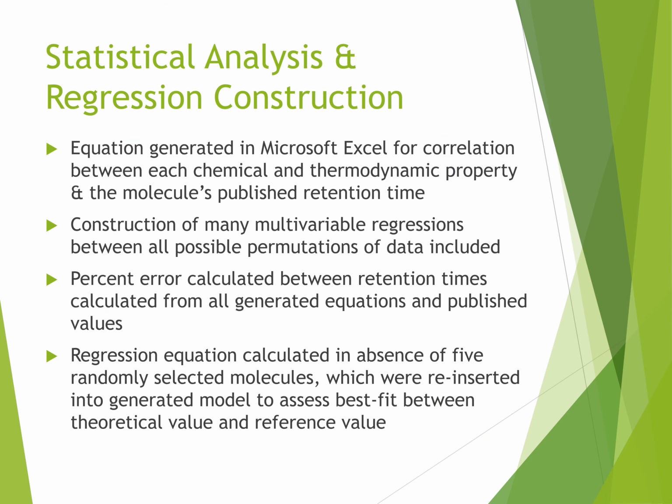After data for this research has been acquired, we will proceed onto the statistical analysis and regression construction. Equations have been generated in Microsoft Excel for correlation between each chemical and thermodynamic property and the molecule's published retention time. Construction of many multivariable regressions between all possible permutations of data will be included. This is achieved using an R code script with the highest R squared values indicating the tightest regression fits within the dataset.